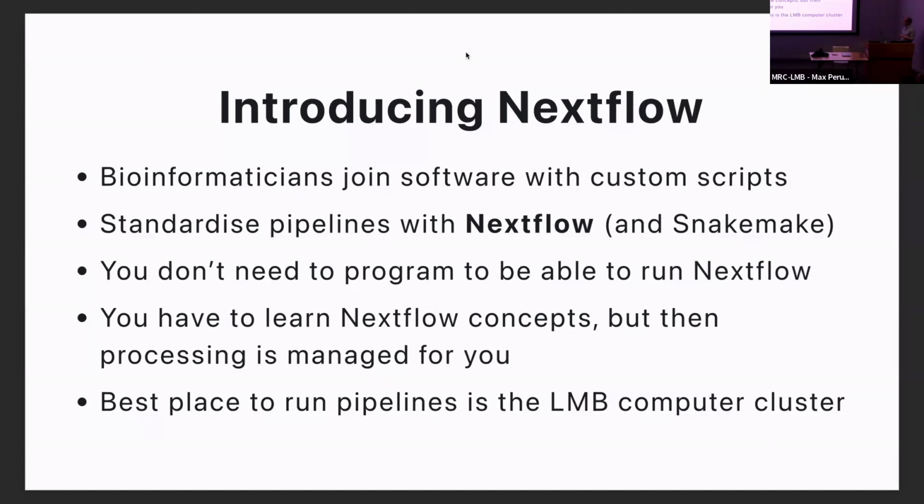And the one I use and I've set up at the LMB is Nextflow. There are other rival pipelines for bioinformatics. I guess Snakemake is the leading contender among these. But that's essentially where we are. We have new programming languages for managing data flow through pipelines.